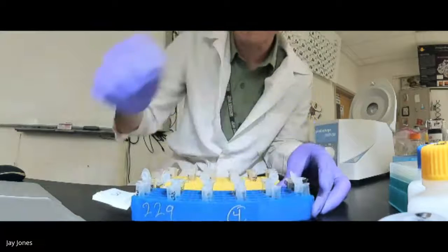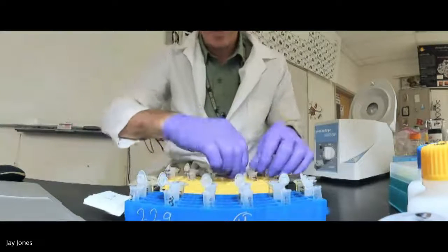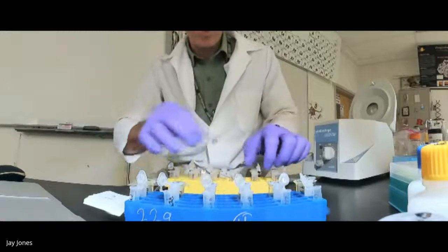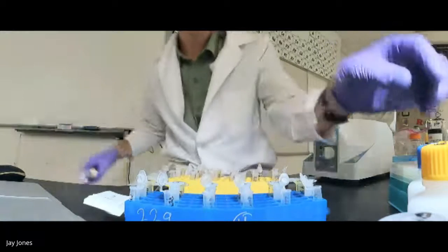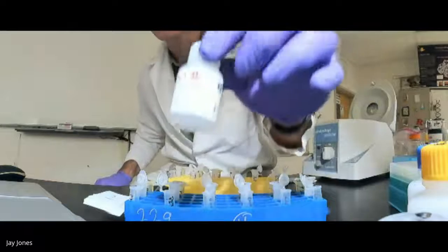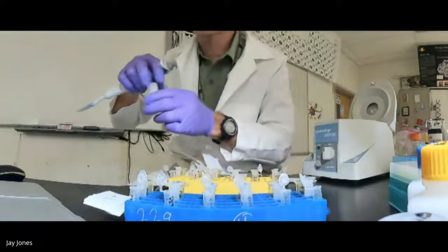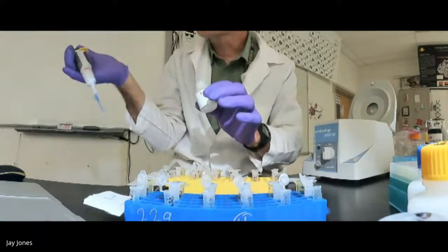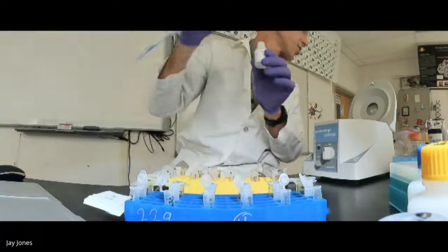I'm going to open up all six of the cell tubes, and I'm going to add times two because there's two classes. I'm going to add 200 of solution two to each tube. All right, so let me double check. Here's my solution two. Okay, here we go. 200. Double check my volumes. 200 of solution two.